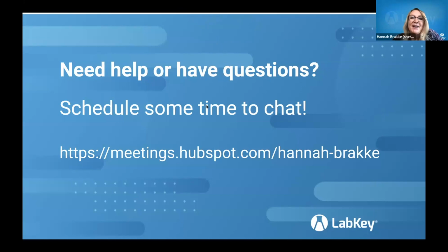And maybe as other folks are working to ask questions in the Q&A, another question that we commonly get is about using workflows, and why do people use workflow jobs? I think the most common cases are really around capturing work that needs to be done on samples. As Steve had his workflow set up for that, we also have people using workflow jobs for sample requests.